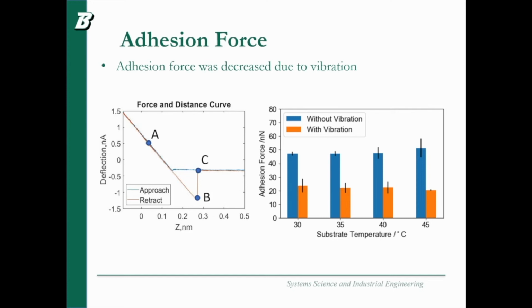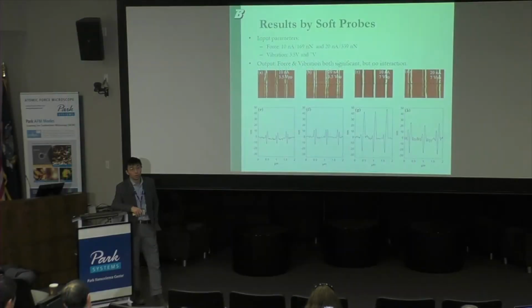And we measure the adhesion force. So you can see it is very consistent after applying the vibration. So it's a very good marriage between the vibration and thermal.